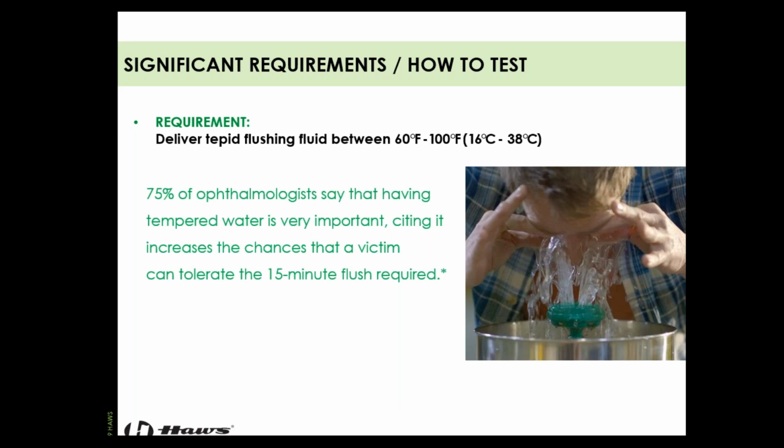It's very important. And what it does, ensuring that the water is in that range, is ensuring that the user is going to be able to maintain that 15 minutes of use. They're going to be able to withstand all 15 minutes. If it's way too cold or way too hot, they might exit the equipment too soon. And we can't have that.